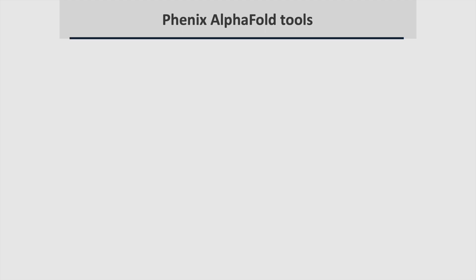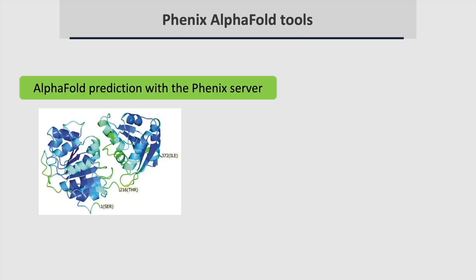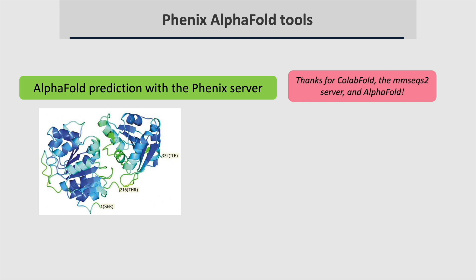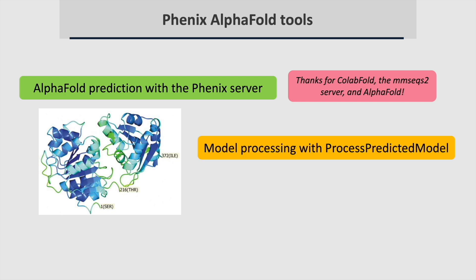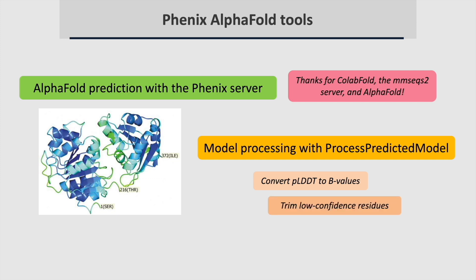Phenix has tools to carry out all the steps in Structure Determination with AlphaFold using x-ray data or cryo-EM maps. The Phenix server, which you can run from the Phenix GUI, uses AlphaFold to predict the structure of your protein. This server is partly based on CoLabFold and uses the MMSeqs2 server as well as AlphaFold. The Process Predicted Model tool will convert the AlphaFold PLDDT values, which are saved in the B value field of the model, into corresponding B values, then trim off low confidence parts and separate the model into domains.